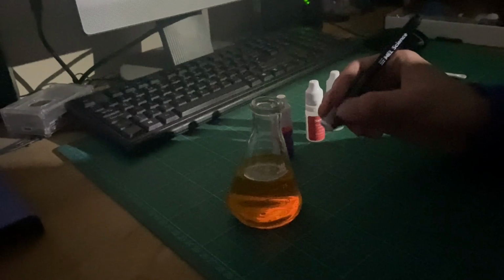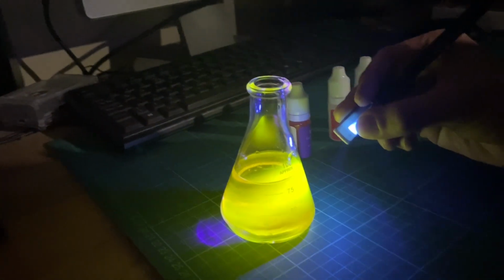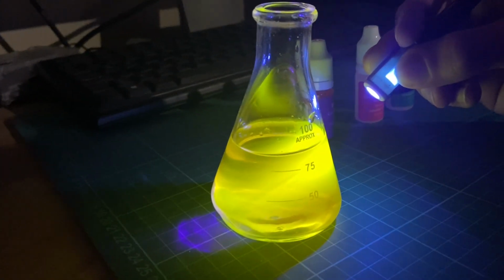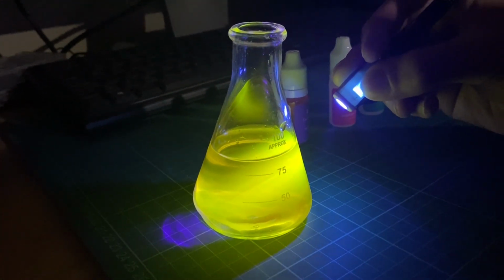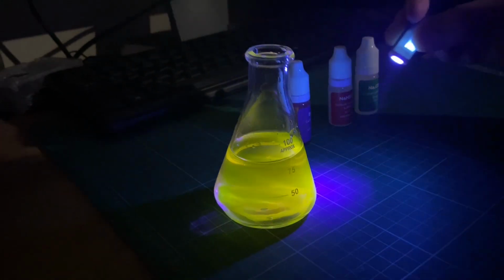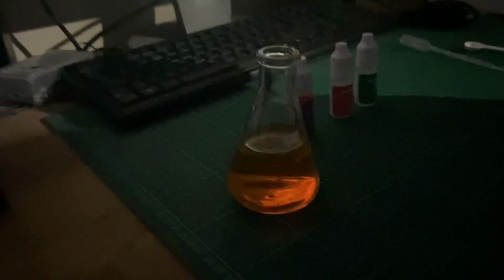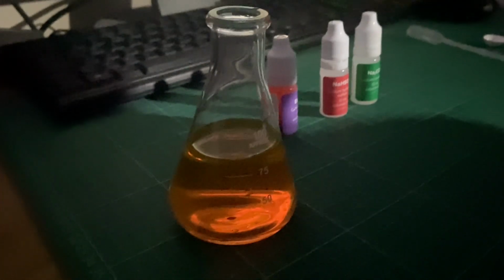Shine UV light on this solution, and it will glow yellow-green. This is because of eosin's pi bonds, which allow electrons to be delocalized in the molecule. This makes the electrons easily excited by UV light, absorbing its energy and then releasing it as visible light when going back to their lower energy states.